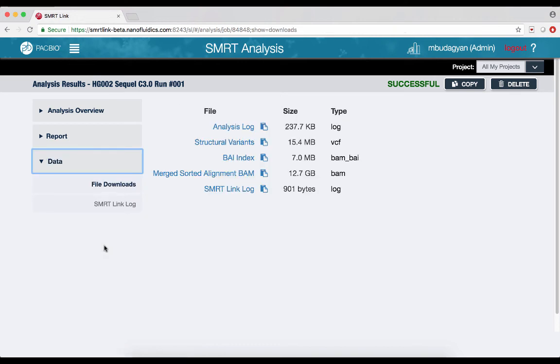The Data File Downloads section contains the reads aligned to the reference in BAM format for visualization in IGV, and the key output file is the VCF file of all called structural variants in standards-compliant VCF format with complete ALT alleles.